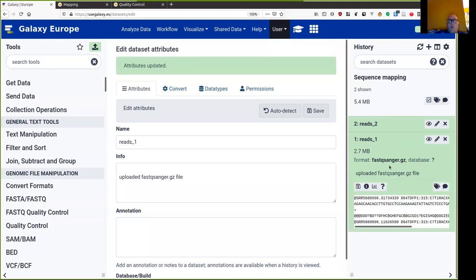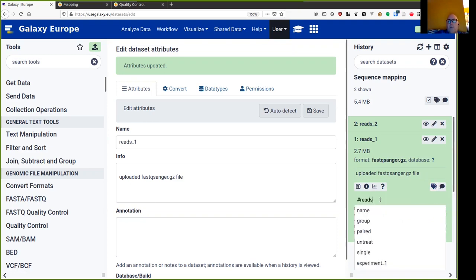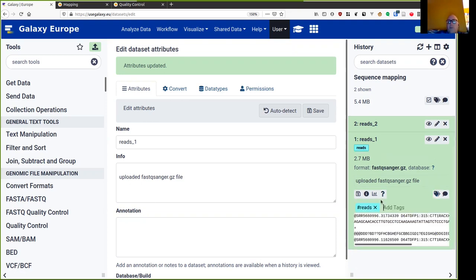You can give your reads a hashtag by opening the detail view and just typing something that starts with a hash.